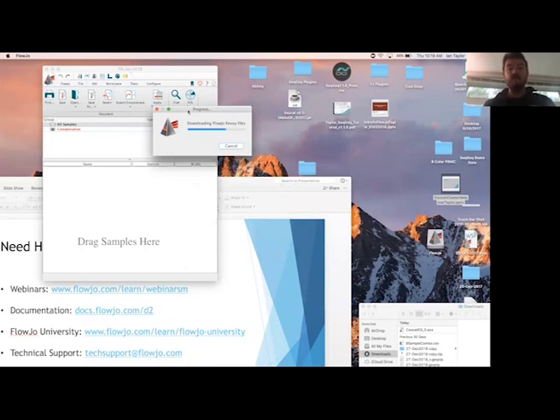So as soon as this is downloaded, I'm going to define some populations, probably just do like a size gate, gate on live events. And then I think there may be a monocyte marker in here that I can use to gate on CD14 positive events. And those are the ones that I'll use for t-SNE. While we're waiting, feel free to drop any questions on me you might have at this point. All right, sweet.